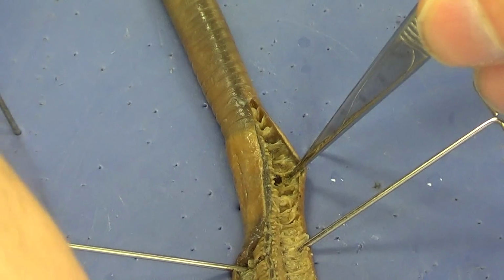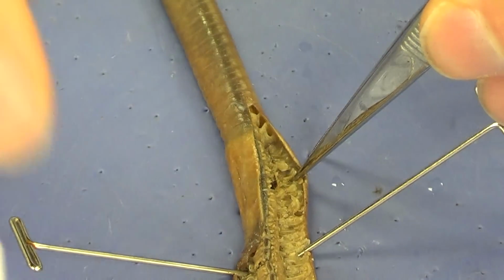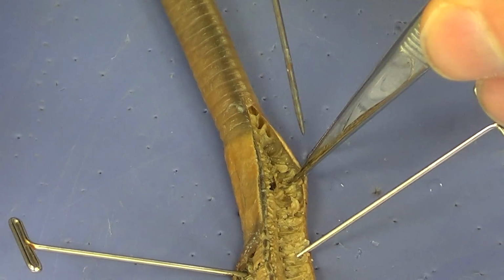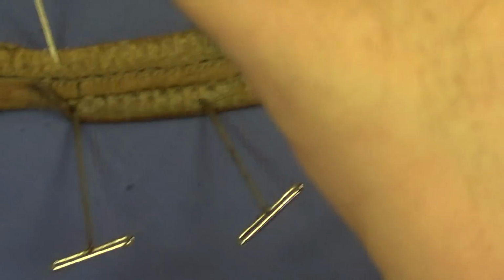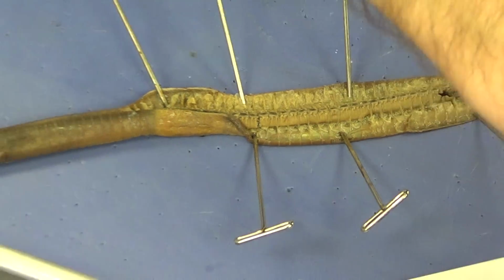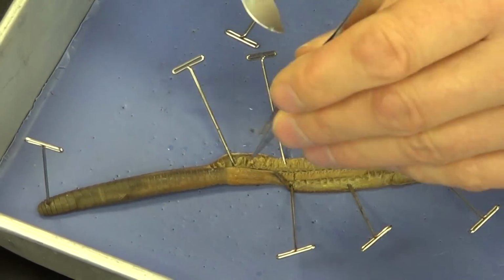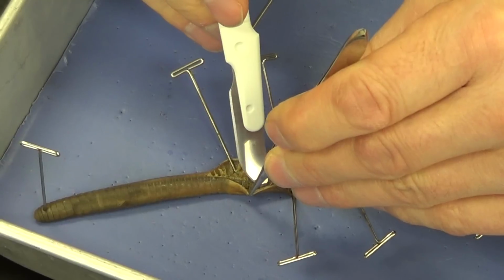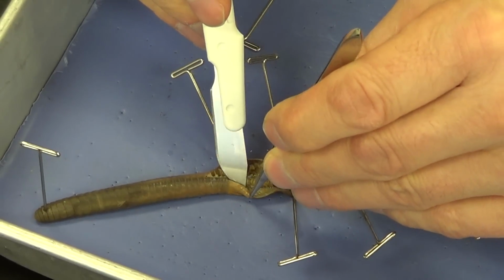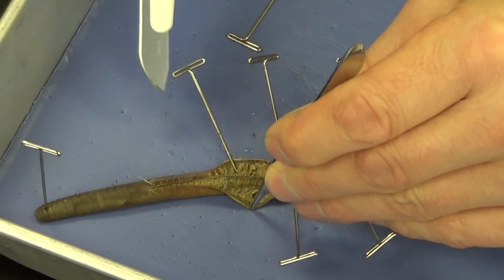You can see some of the septa are still intact there. I'm going to go ahead and cut through those septa. I'm going to pin this back, making sure to keep my pins very shallow, coming in at a very low angle. Now I'm going to go ahead and do the other side. I'm going to take that skin, pull it back, and cut those septa. And I'm going to work my way anterior.